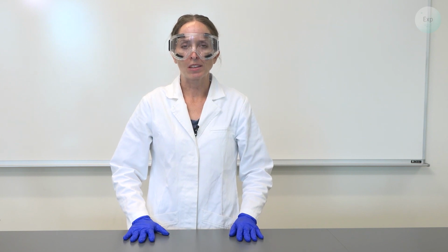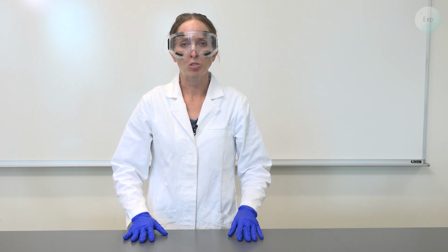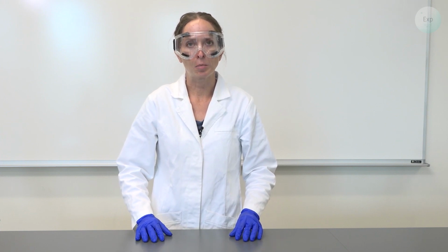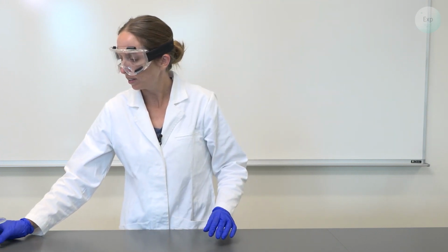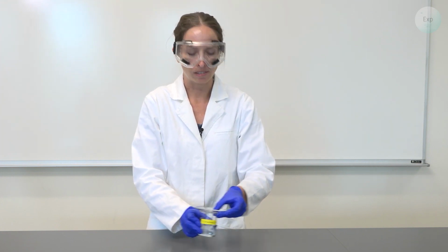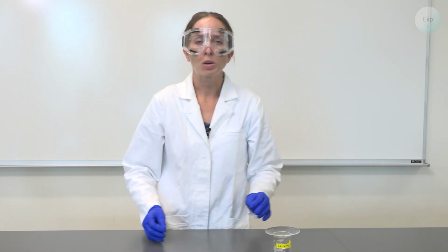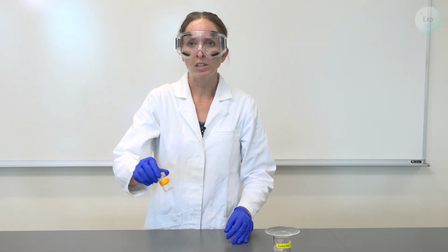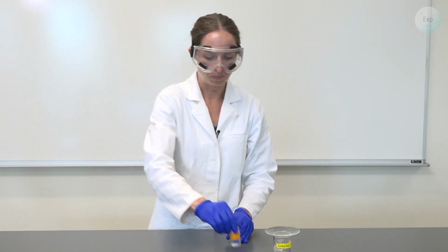Dr. Laura Jakubowski, and in this video, I am going to demonstrate how to do a TLC analysis on our extracted caffeine sample. So we are going to need the extracted sample, which should contain caffeine in the ethyl acetate. We're going to compare this to a known sample of caffeine. So we will need just a small amount of caffeine.